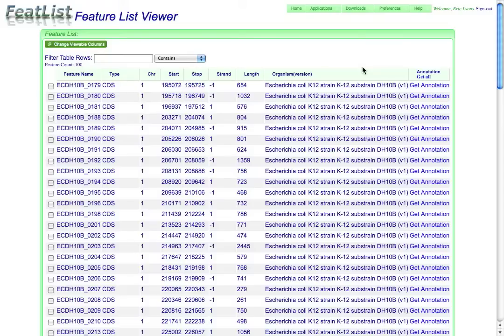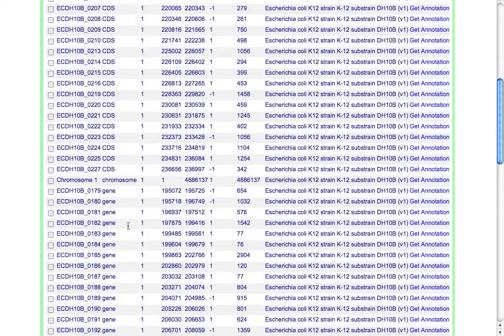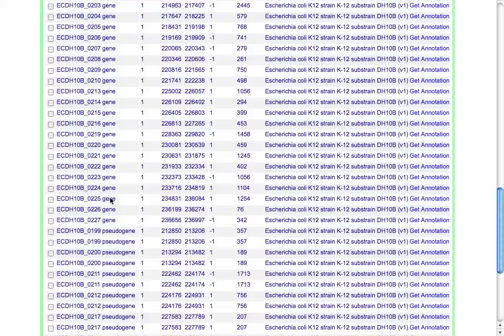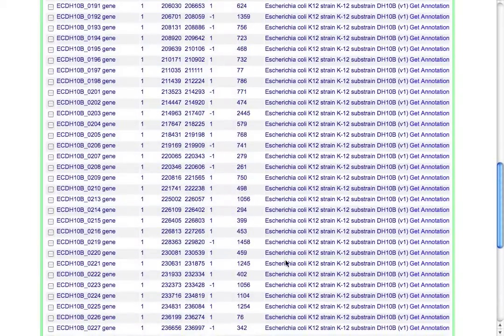In this case, I've extracted 100 features from E. coli's genome, and we have a whole bunch that are protein coding features. We've got the chromosome from which they were extracted, a whole bunch of genes, pseudogenes, ribosomal RNAs, a repeat region, and several tRNAs.